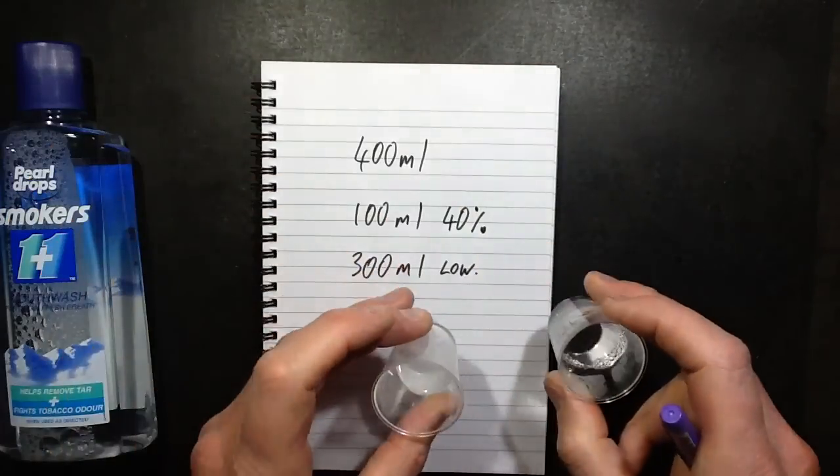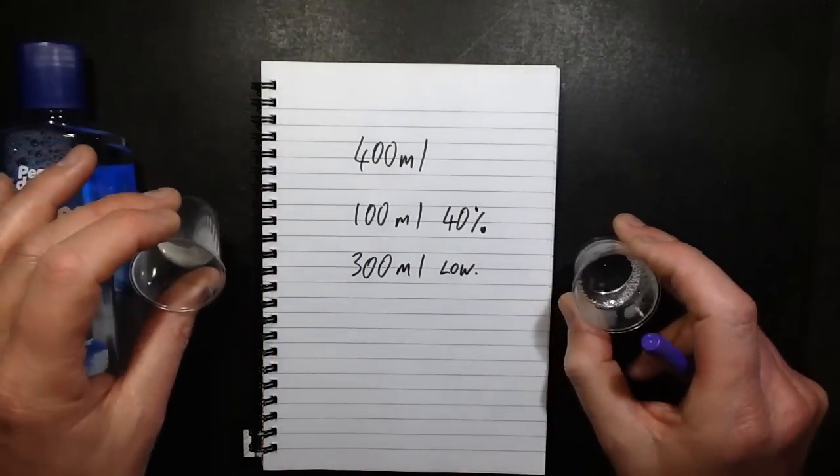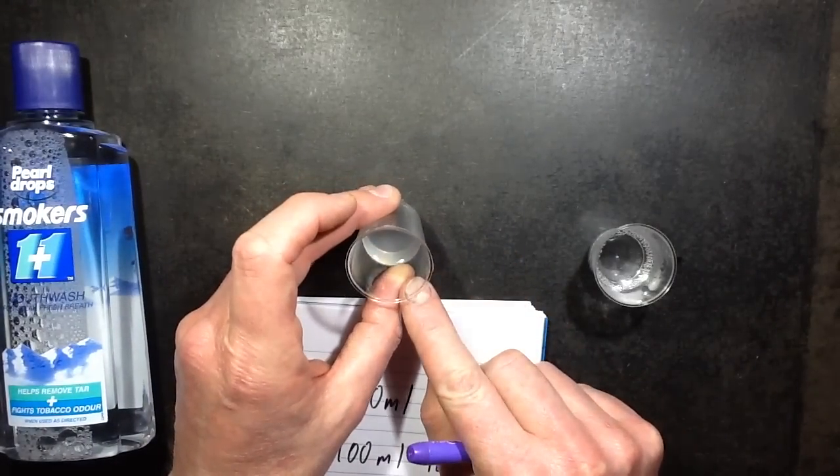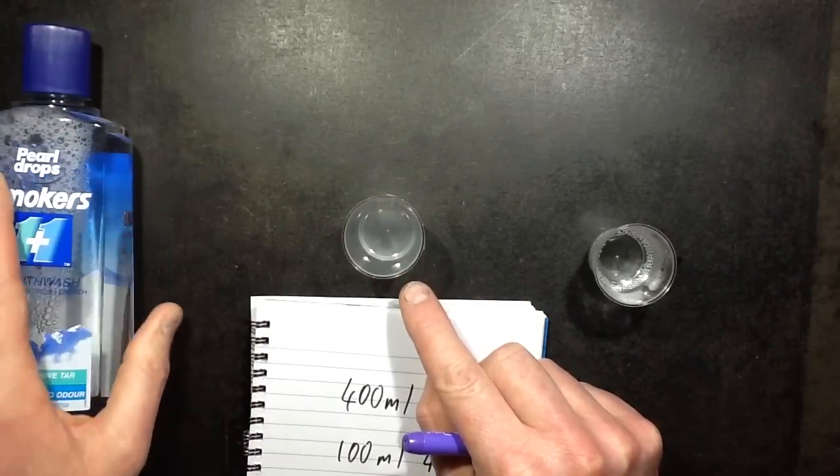And the two liquids it's separated out in, the alcohol one has a very cloudy look to it, suggesting it's got a lot of oil in it. And that kind of fits, because these tend to have menthol oil.